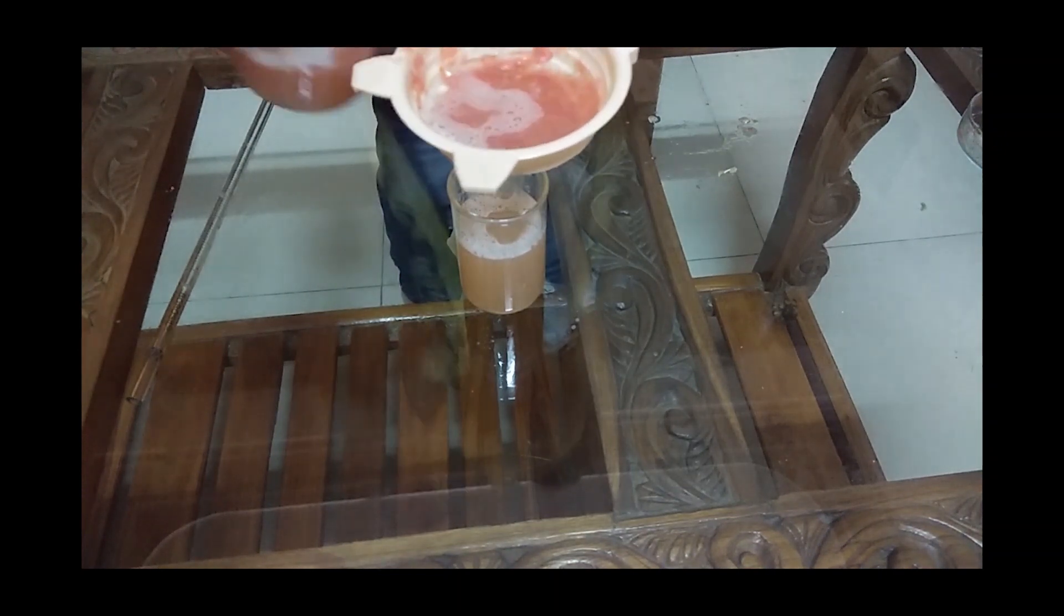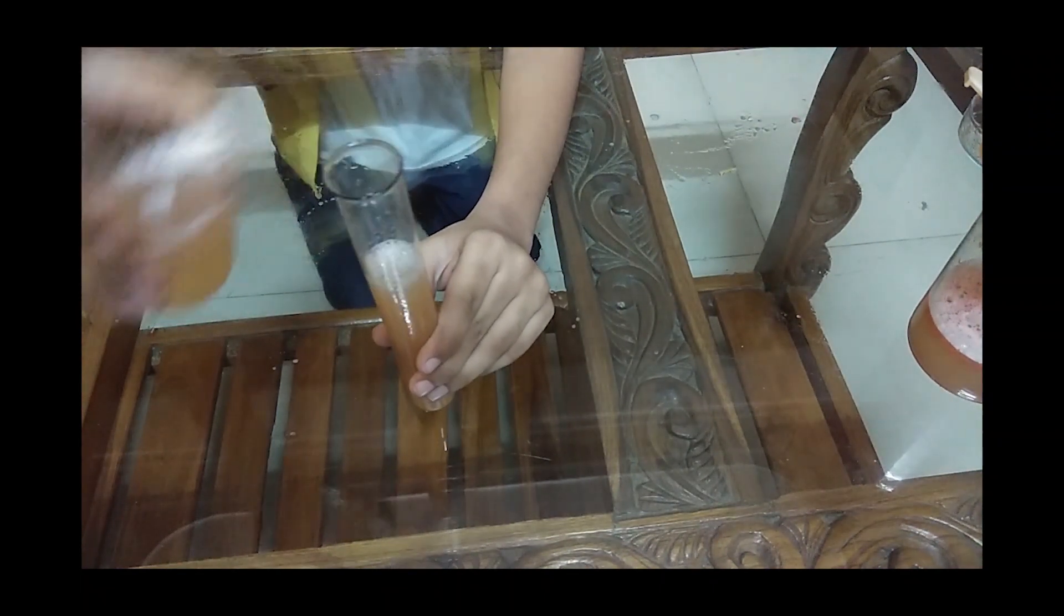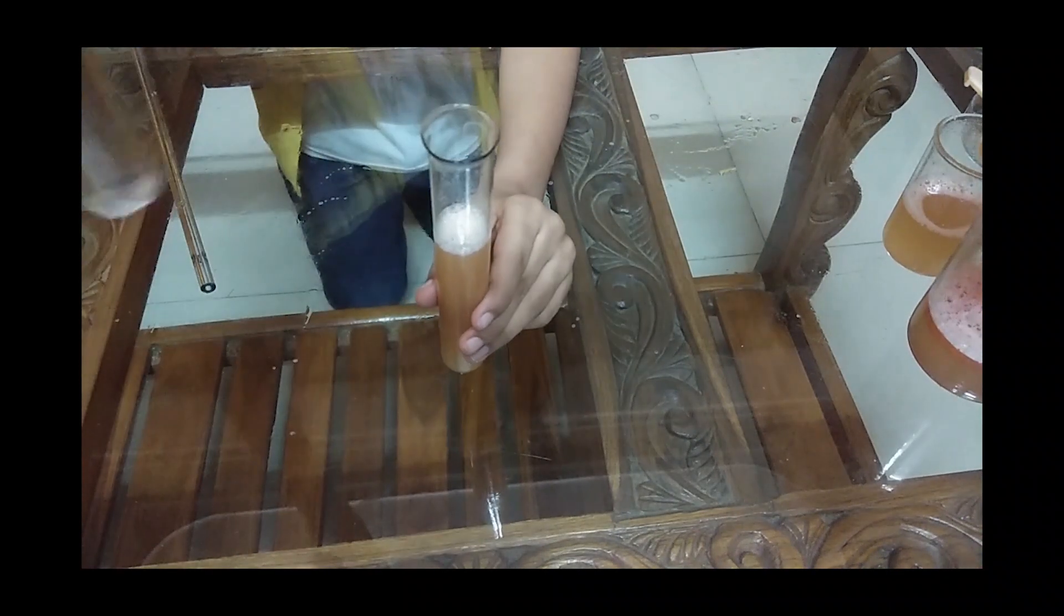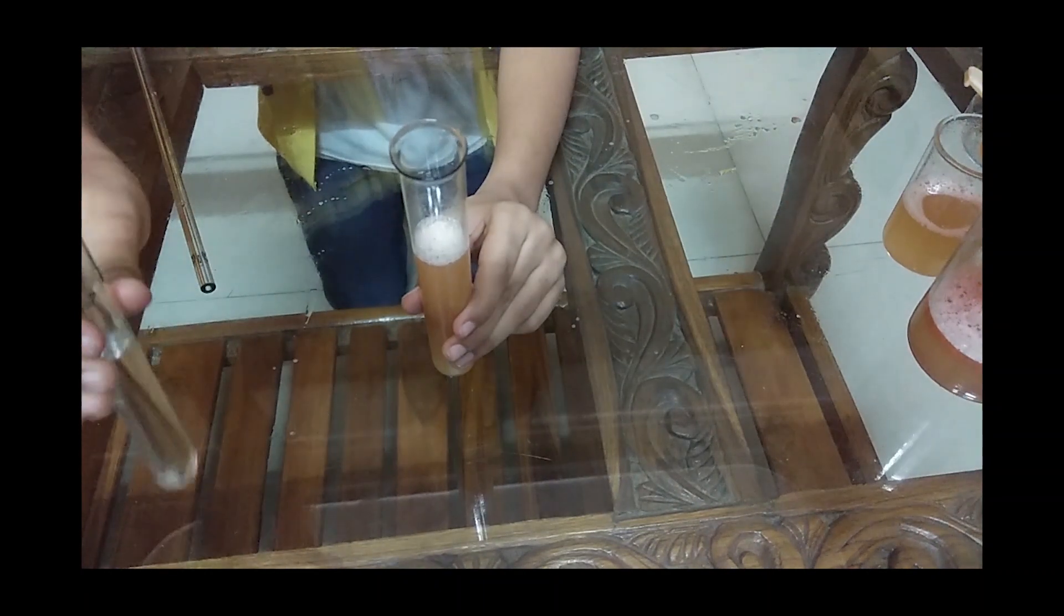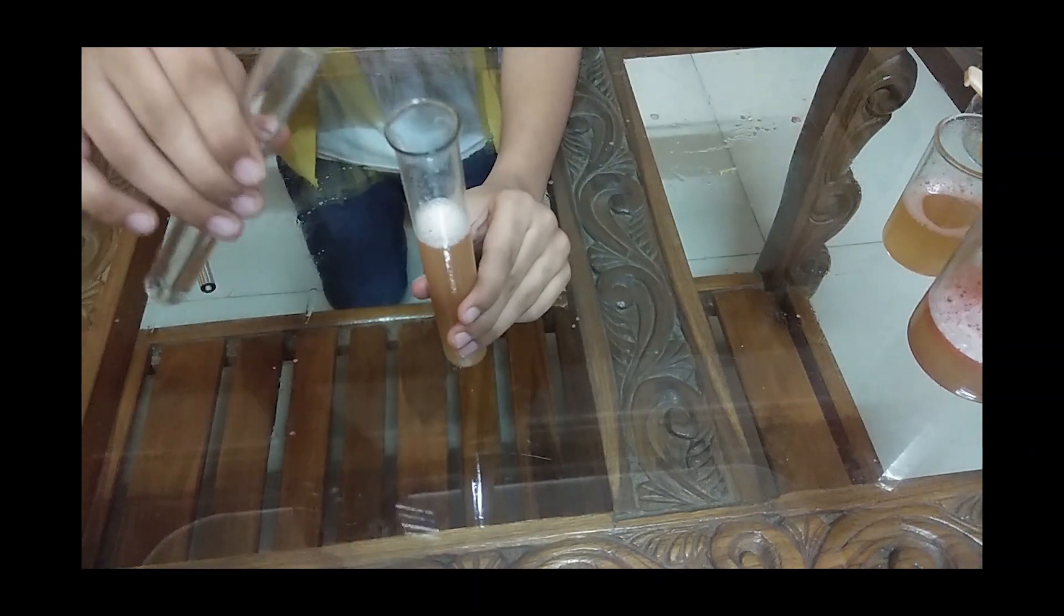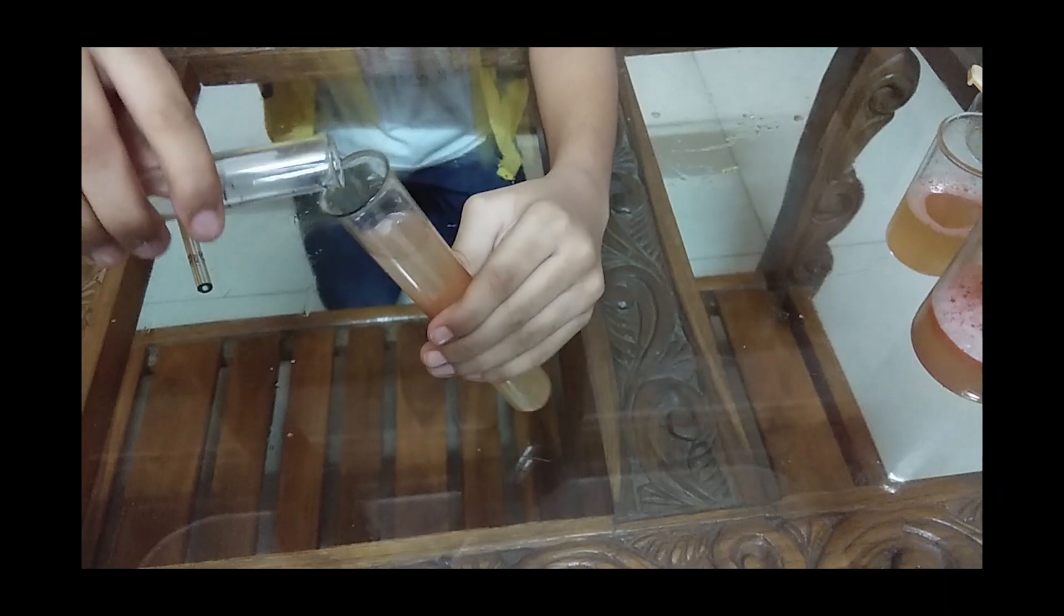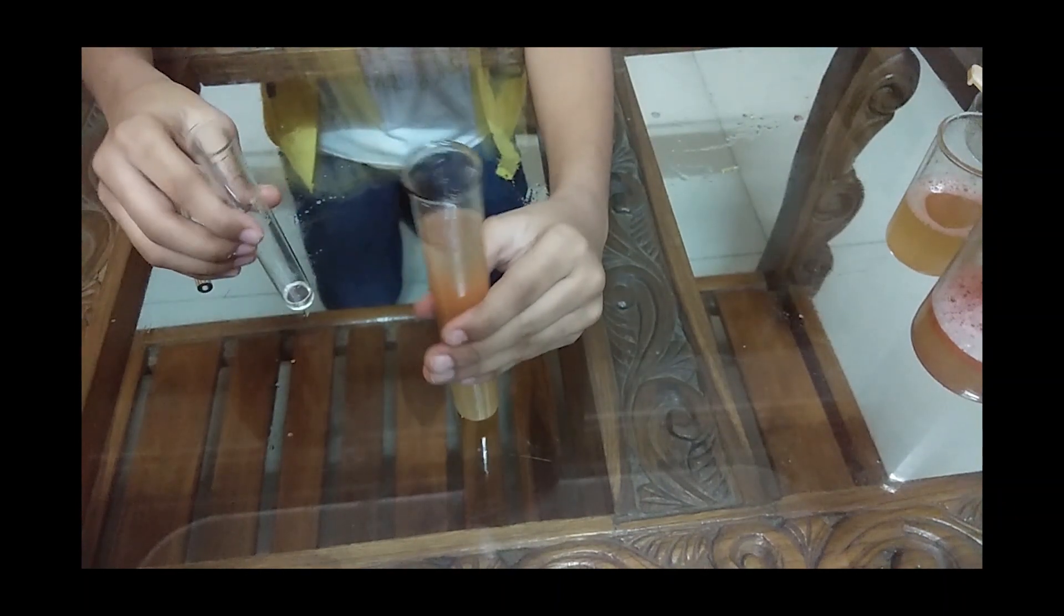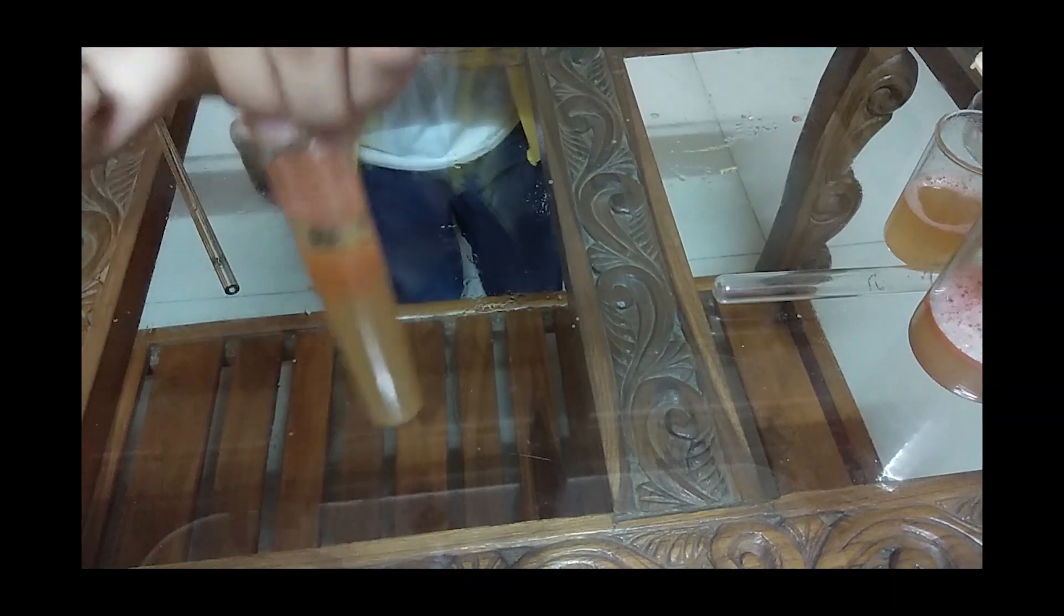That is enough. Now pour this gently into a test tube. This is ethyl alcohol in another tube. You can use surgical spirit from the market, or girls, nail polish remover also contains ethyl alcohol. Now you will pour this very gently from through the inner surface. Ethanol is not soluble - DNA is not soluble in ethanol.